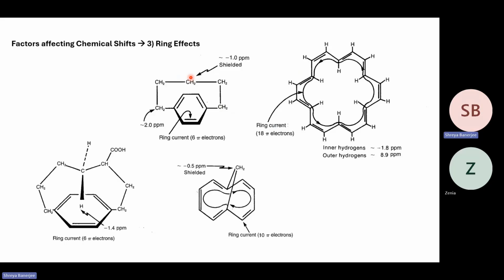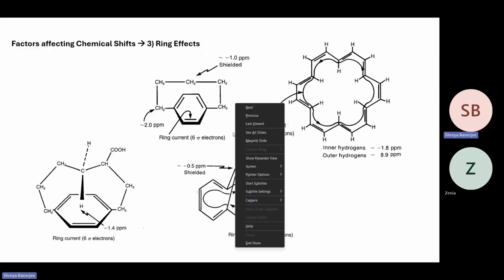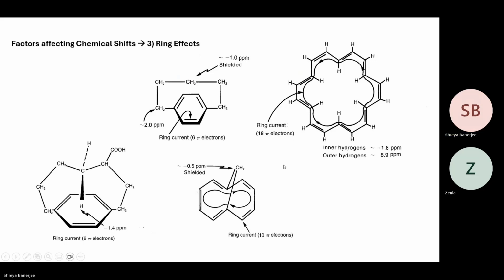And then there is a certain connection, and this middle hydrogen actually appears around the middle of the ring. So what we saw in the previous slide, we saw the applied magnetic field in the upward direction. And if we consider this the induced magnetic field, it is downwards here and up. So this hydrogen is experiencing the induced magnetic field downwards, applied magnetic field upwards.